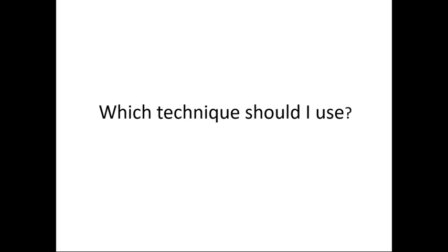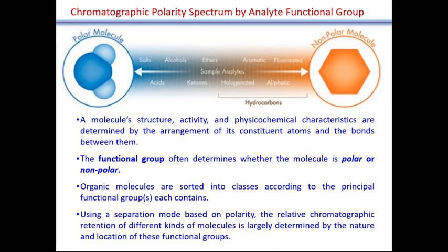or need to understand before starting, an HPLC experiment. So if you look at the analytes, you have to study their polarity spectrum. So you have to know some information about the structure and the nature of the analytes that you are interested in separating. So you need to know the functional groups, you need to know the structure, and based on that, you can tell whether the analytes are polar or non-polar.